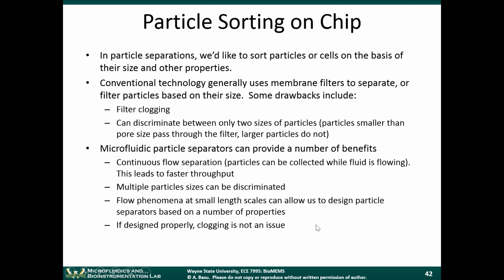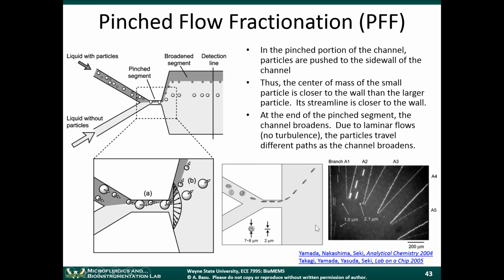So let's look at some examples here. Pinch flow fractionation is one of the earlier papers that came out, about 10 or 11 years ago. Pinch flow fractionation uses laminar flows to sort particles, and I think this is a very nice illustrative example.